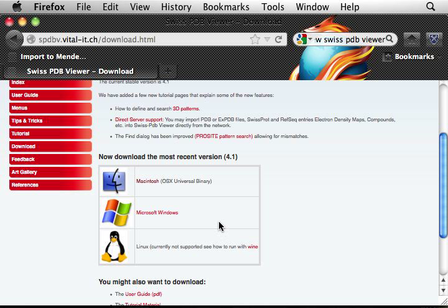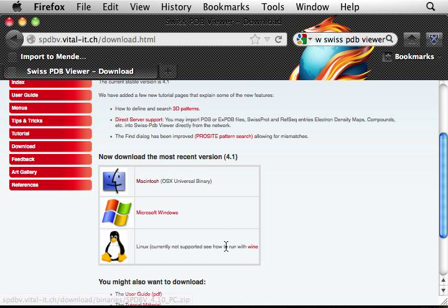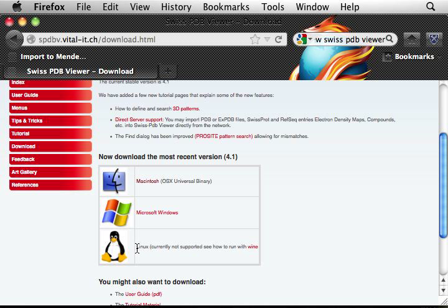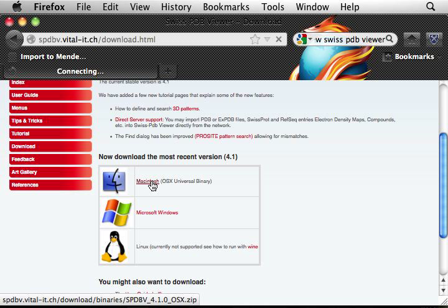If you use a PC, you download the Windows version. And for some of you use Linux, I'm going to ignore that. So click download the Mac version.